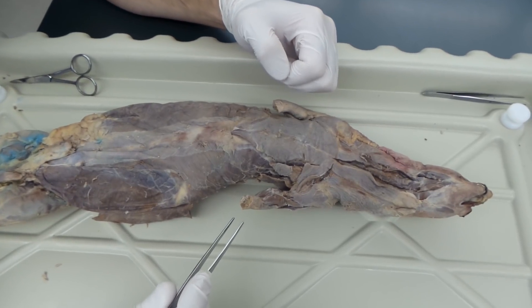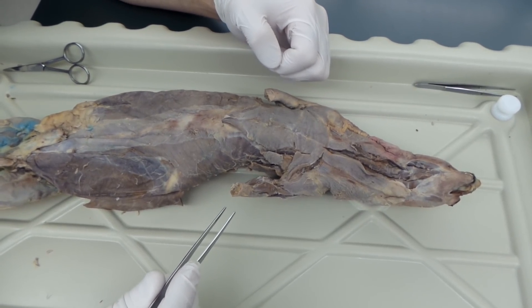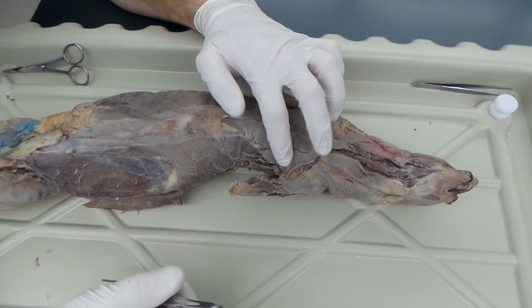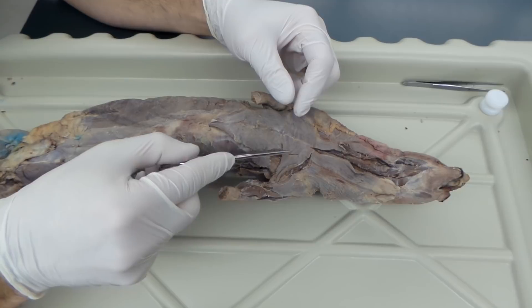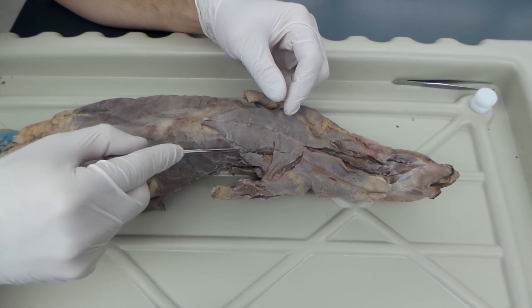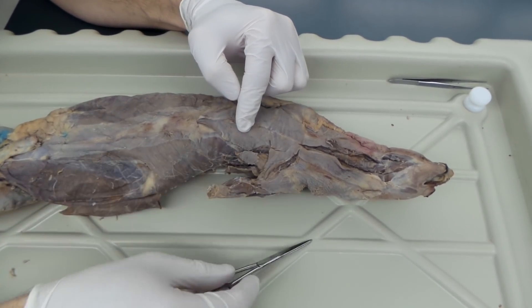This is exam two, day one. We're going to look at deep muscles of the back and muscles of the arm. First thing we're going to do is deep muscles of the chest. We're going to go ahead and cut through some of our pecs — pec minor, pec major.